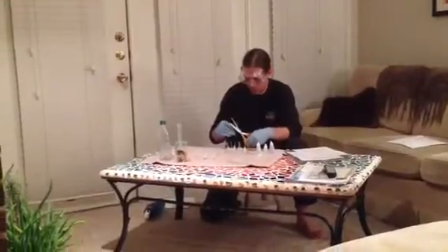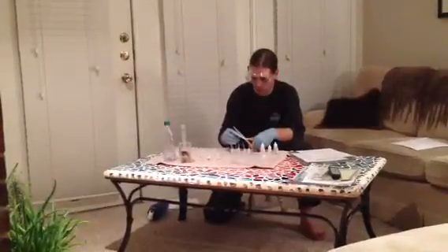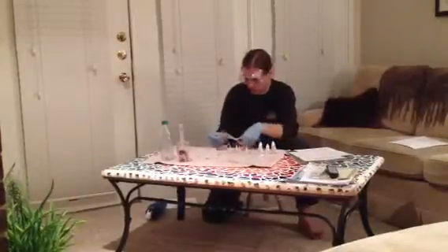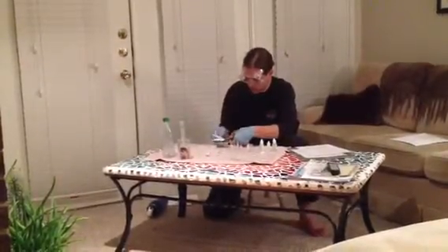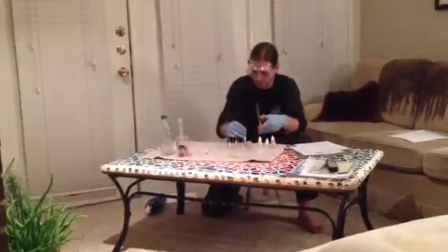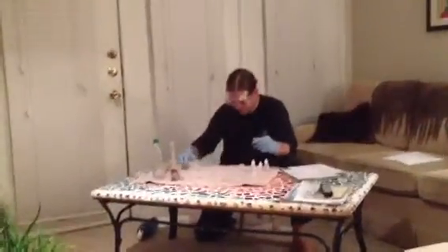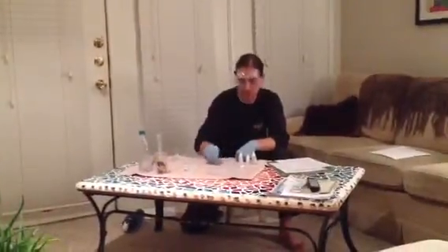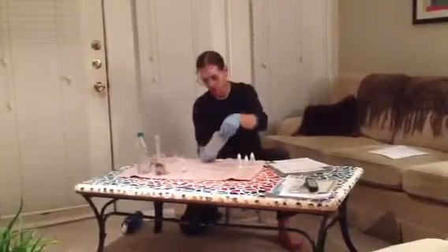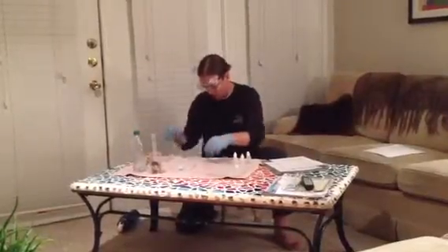Got my gloves on to keep me protected here. They are open. Set that to the side. Take some of my glass test tubes. And we will get started.